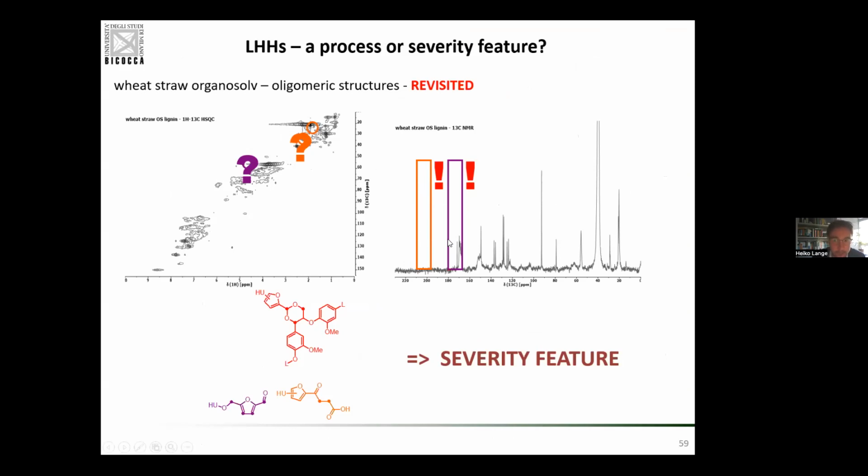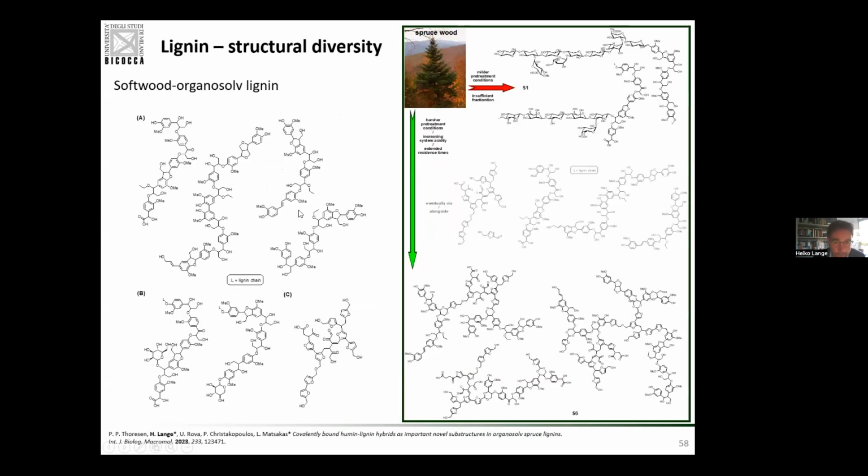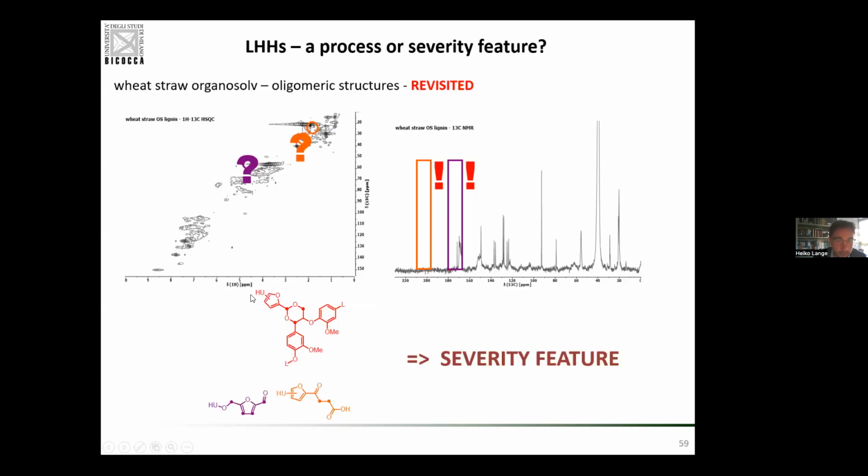Then, taking the carbon NMR, we see that the corresponding other peaks that fit the structure, like the quaternary ones here, for example, are missing. So we don't have them, so the structures are not in there. So it's a nice combination. Obviously, even if I don't show you the phosphorus spectra for these structures, without the phosphorus data, guys, we don't arrive at these structures, because we need to correlate whatever we see as structural units in the HSQC to our phosphorus data.